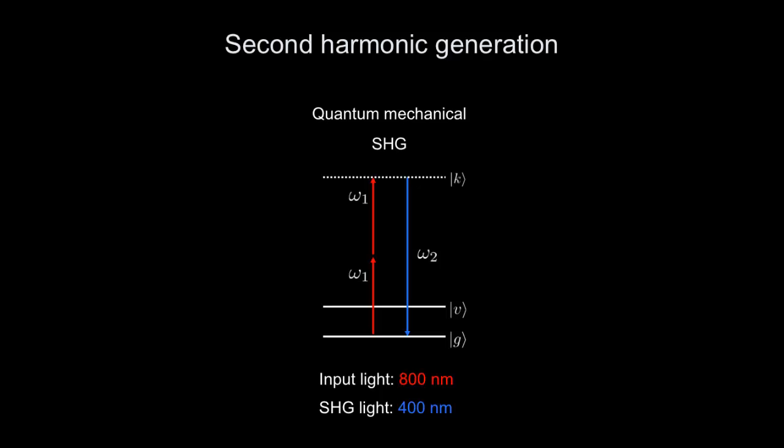Okay, but look, this is interesting. 800 nanometer is pretty far to the red of my visible spectrum. In fact, it's almost outside of the visible spectrum. So 800 nanometers can be called near infrared radiation. That light is much less sensitive to scattering than is this light. So in second harmonic generation, the excitation light is less sensitive to scattering than the light that comes out. If you deal with one photon excitation processes, you deal typically with wavelengths in this range, which is very sensitive to scattering. But here on the excitation side, you deal with this light, which is not so sensitive to scattering.